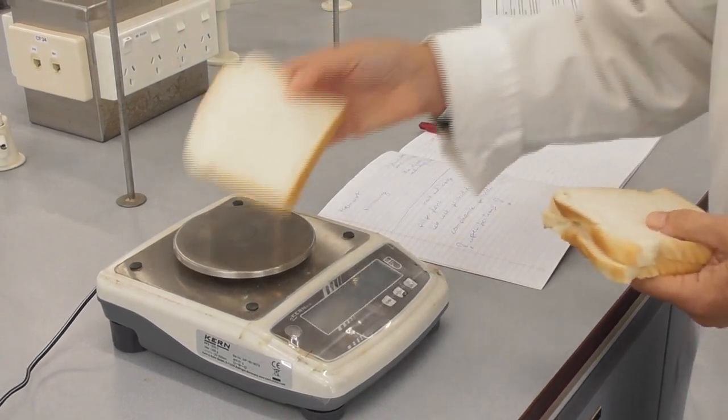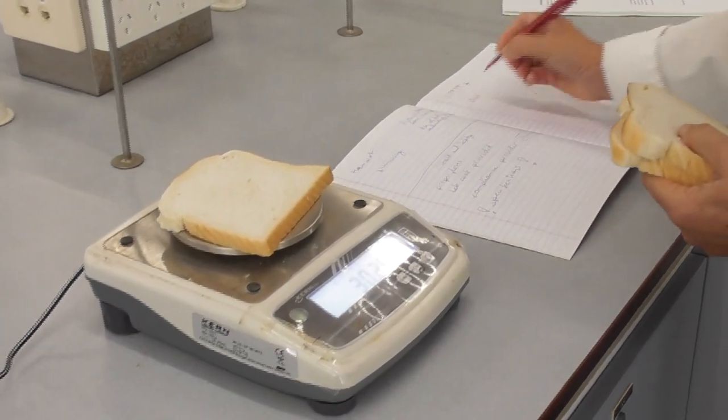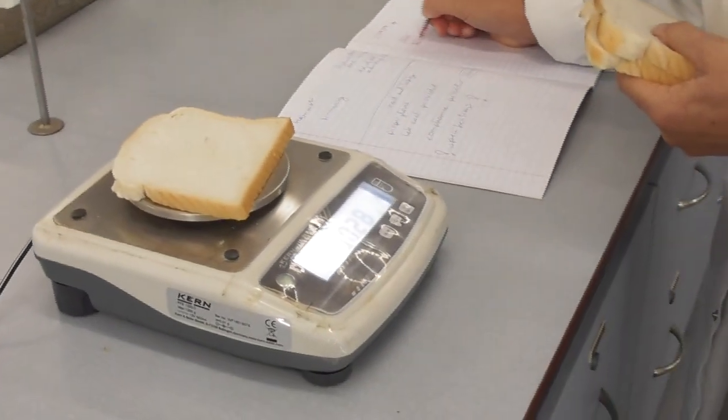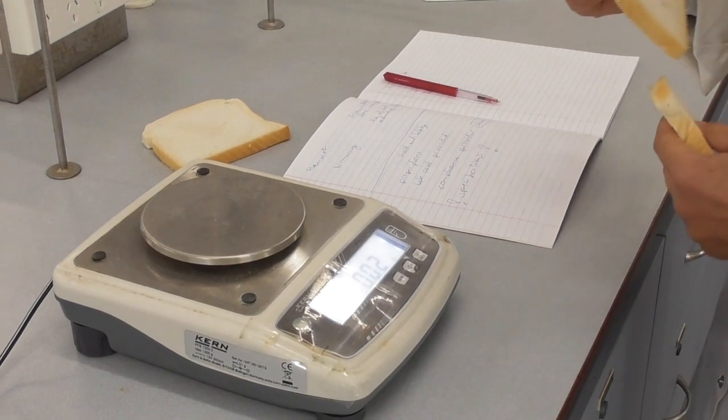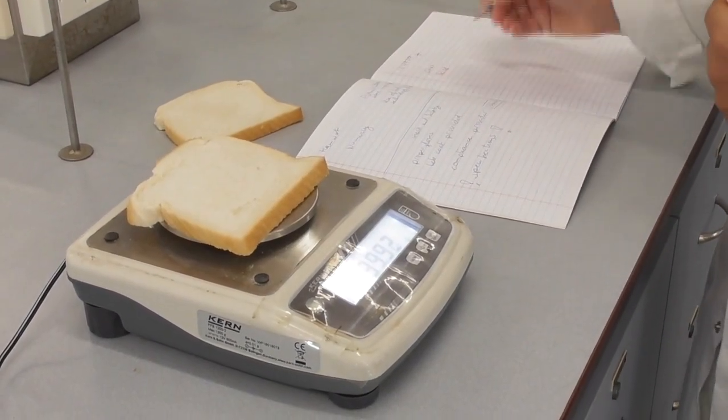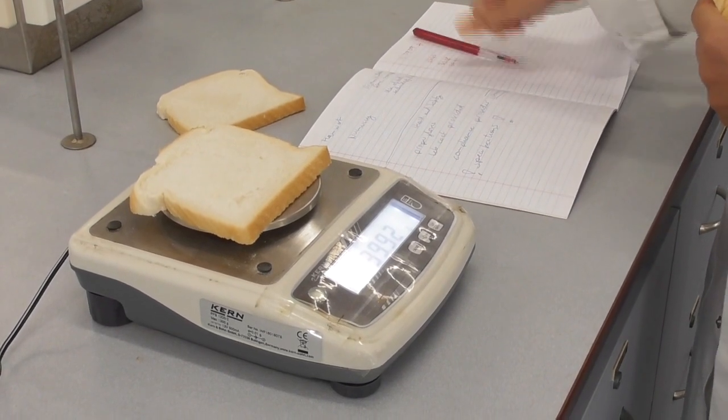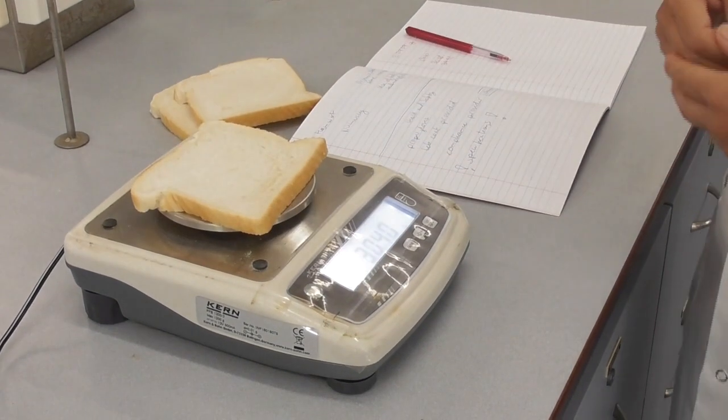In this experiment we are trying to determine the calcium content in bread. I start out with weighing three slices of the white bread I am using on a balance and noting down their weights. I will use these three weights to determine the average mass of a slice.